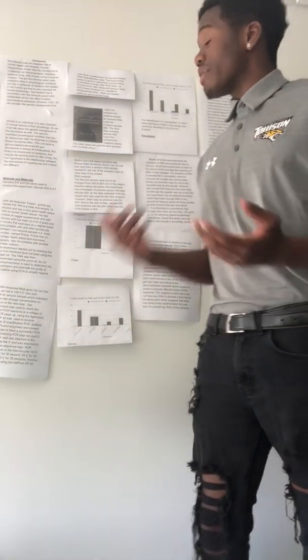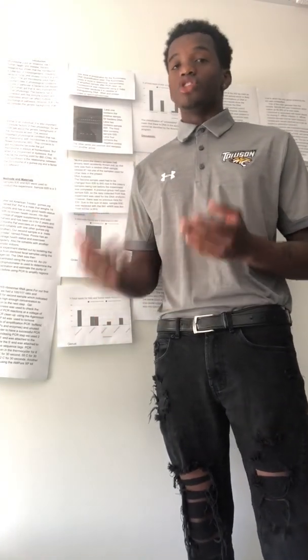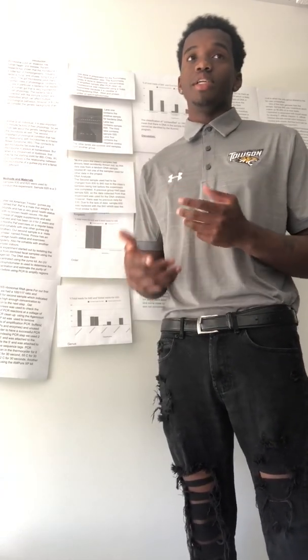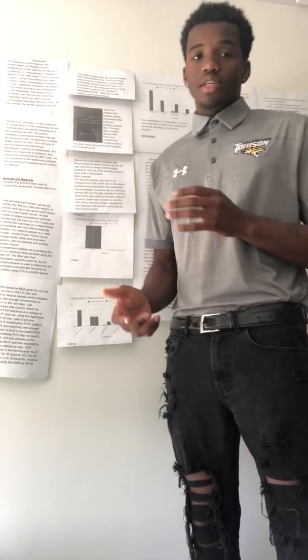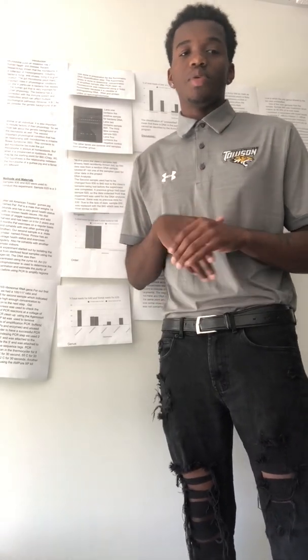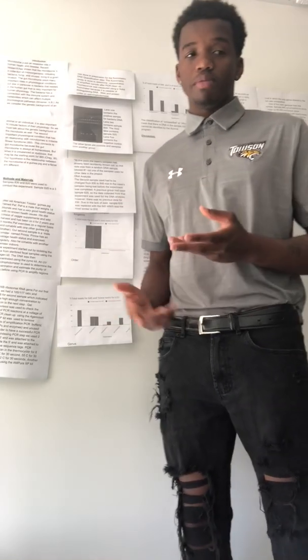And our hypothesis was supported because DNA analysis showed many differences between sample 840, which was a ferret, and sample 620, which was a guinea pig.